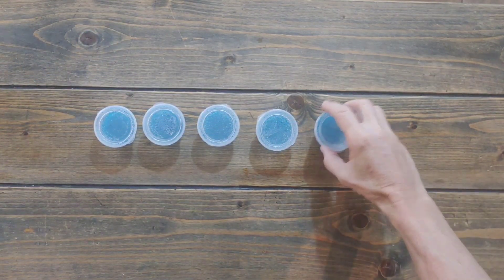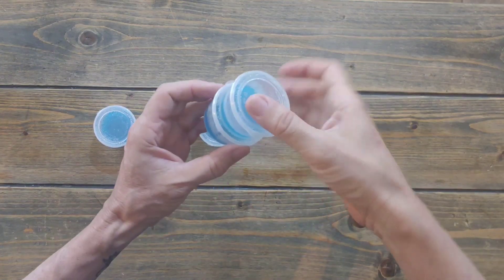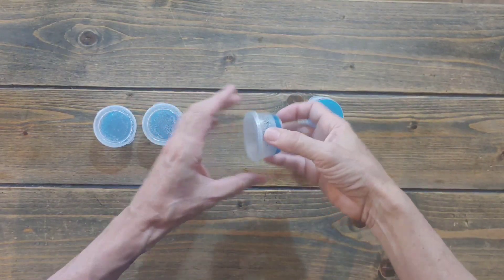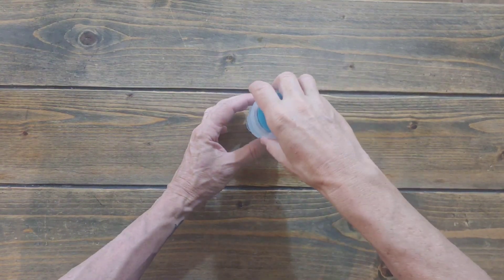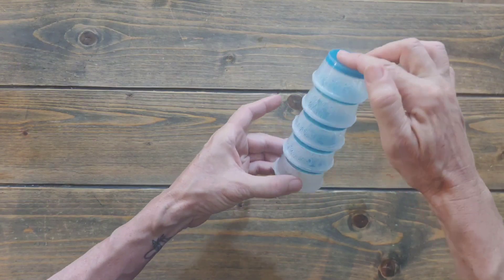Let me show you something else that's cool about these — they stack. See this? When you put them upside down and stack them, they stack right on top of each other. Very convenient for storage.